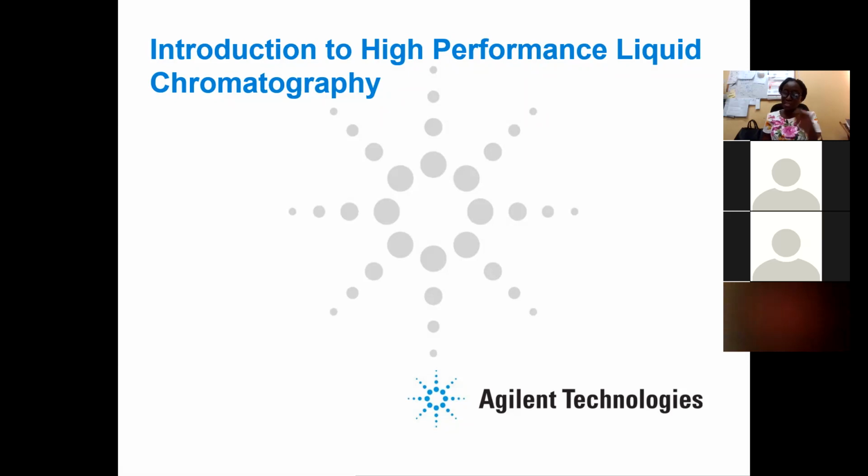So I will start by injecting standard 1 of 1 ppm. It will give me an area. So I will have a table of my concentration and peak area. I will inject standard 2, get the peak area. Inject standard 3, get the peak area. Inject standard 4, and you know that your peak area is directly proportional to concentration. So as concentration is increasing, your peak area is increasing.